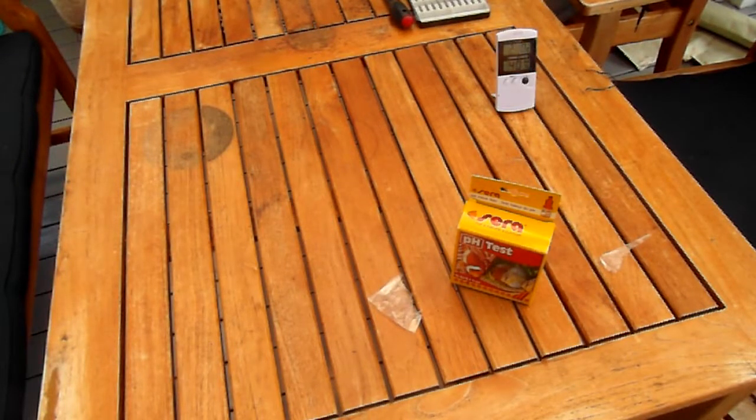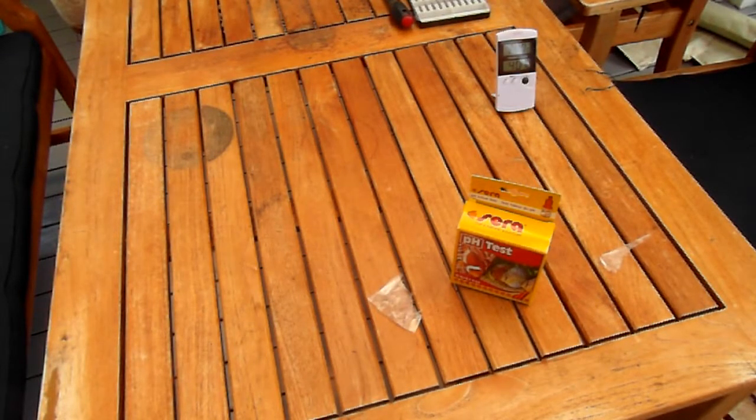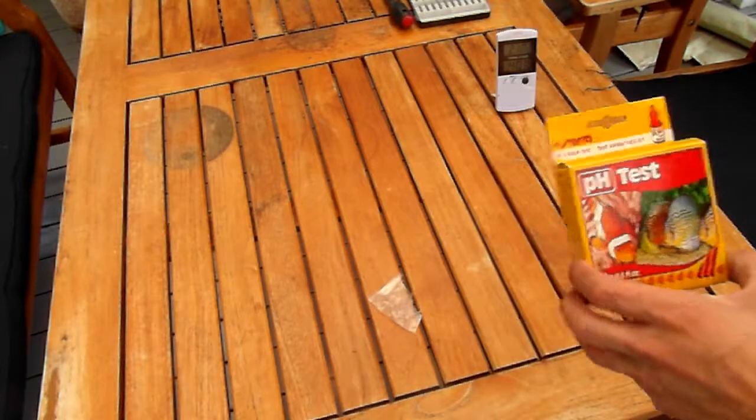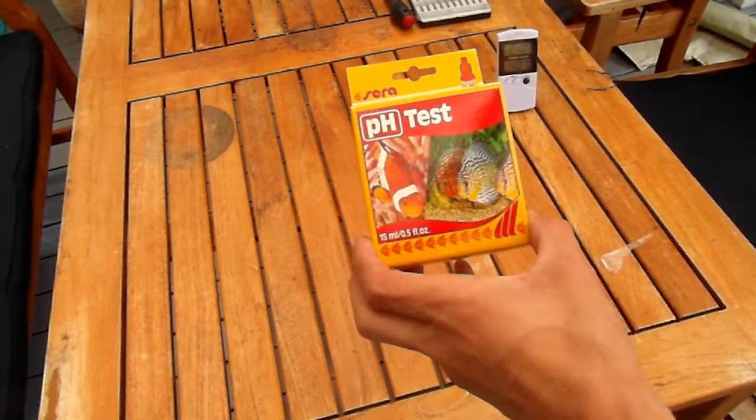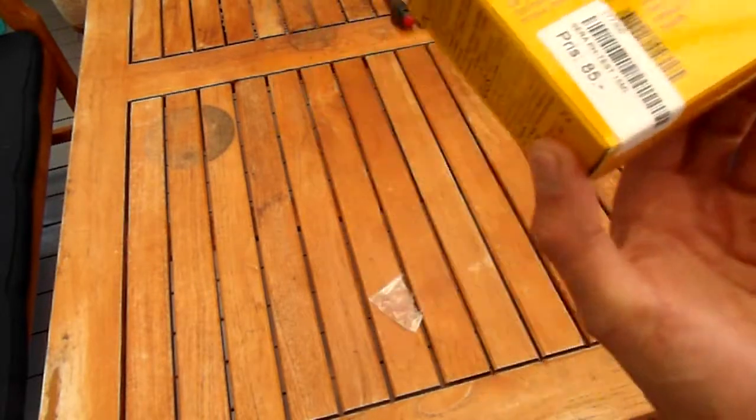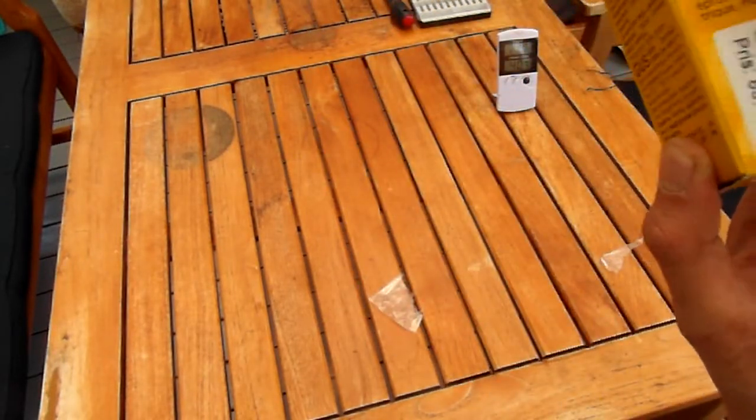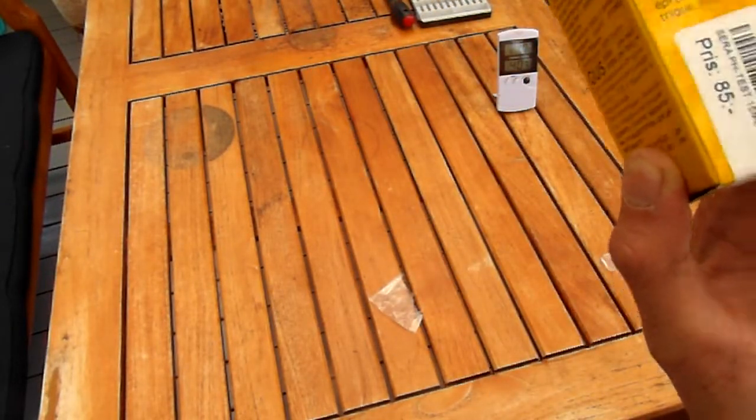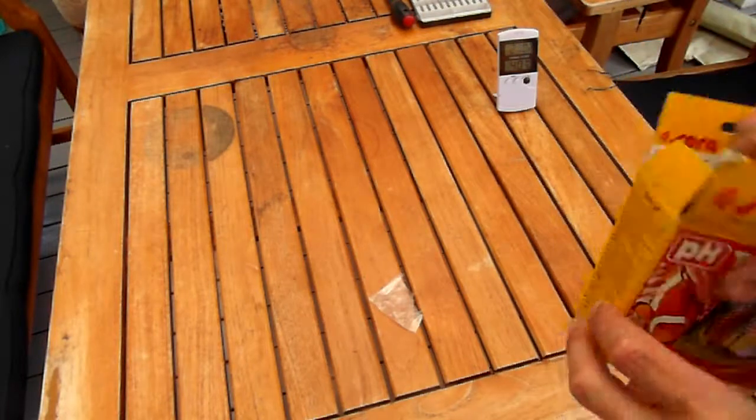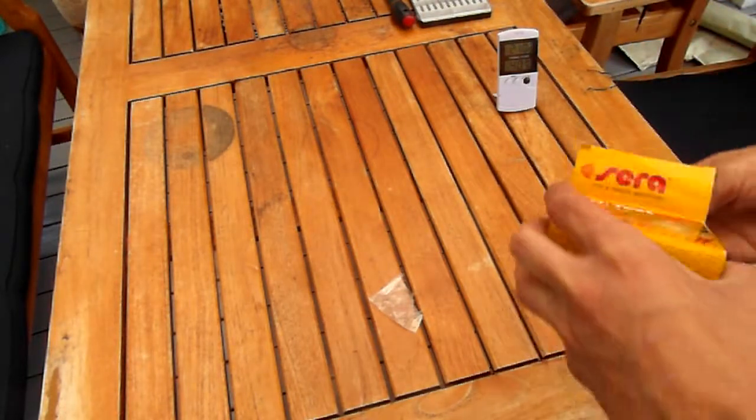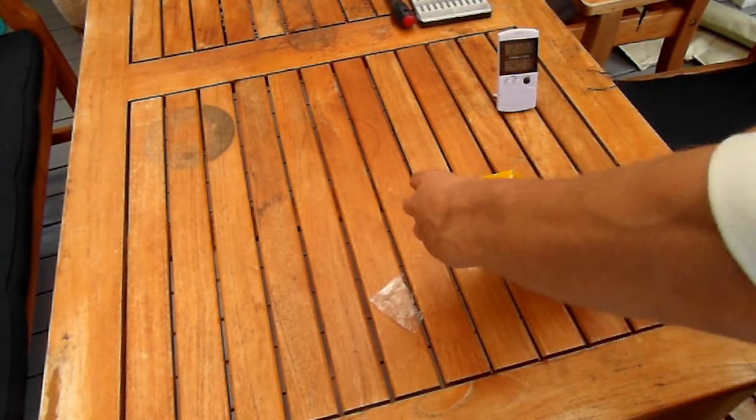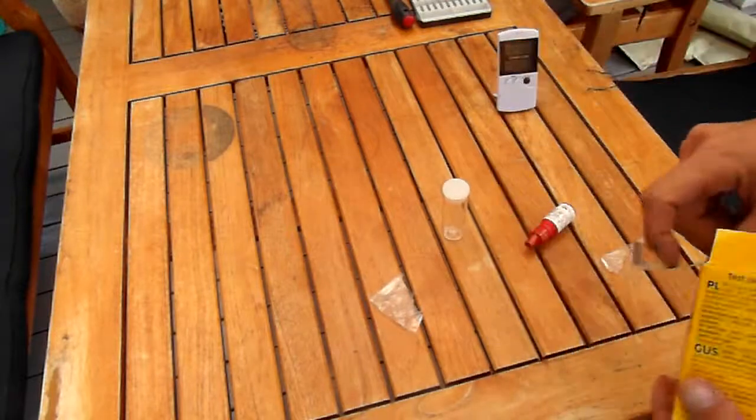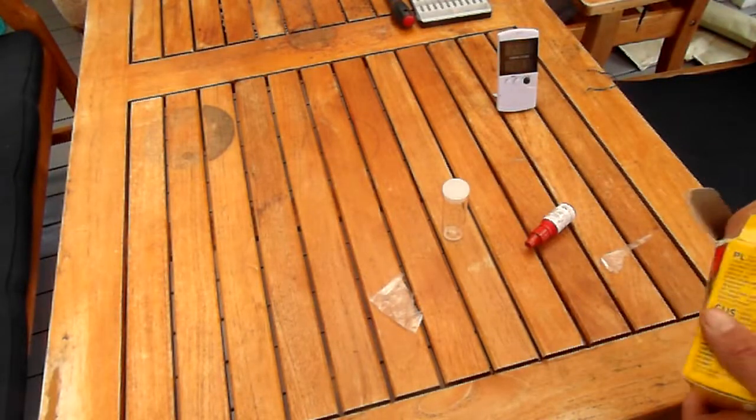And the third one is a live demo test. I got a pH test capable of going from 4.5 to 9, and again, read the manual.